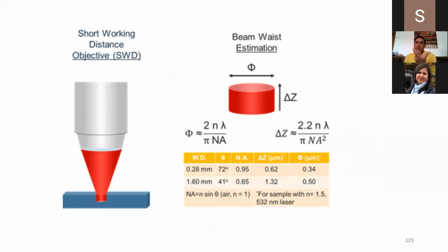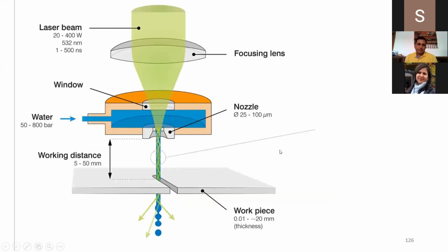In the case of liquid samples, the peak intensities are very poor, so you can make it broad. So for a solid sample, you can have a 2 micron hole size. For liquid samples, you can have a 40 micron hole size. And this Z is called the depth resolution, which we can control. How can we control it? I will tell you here.